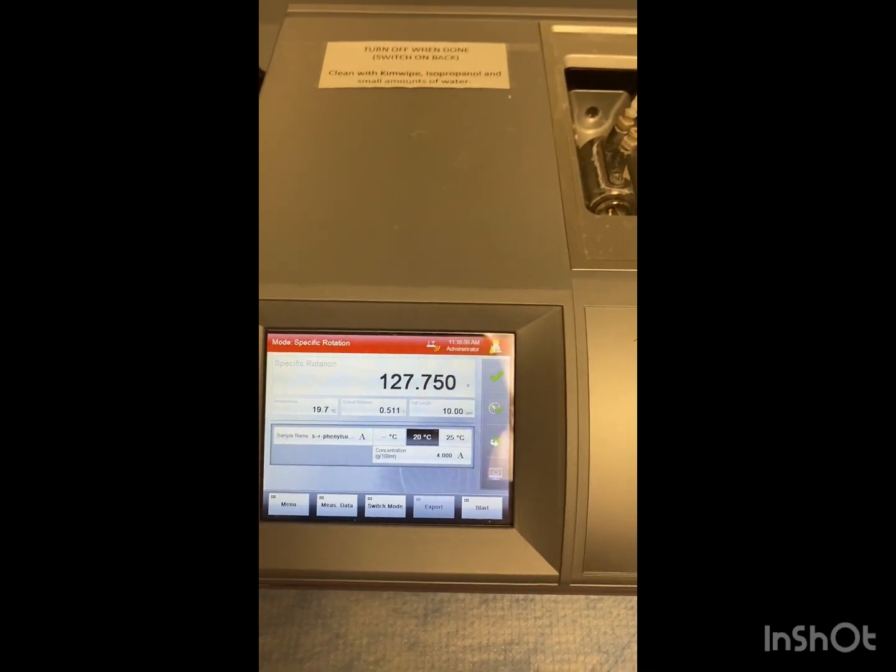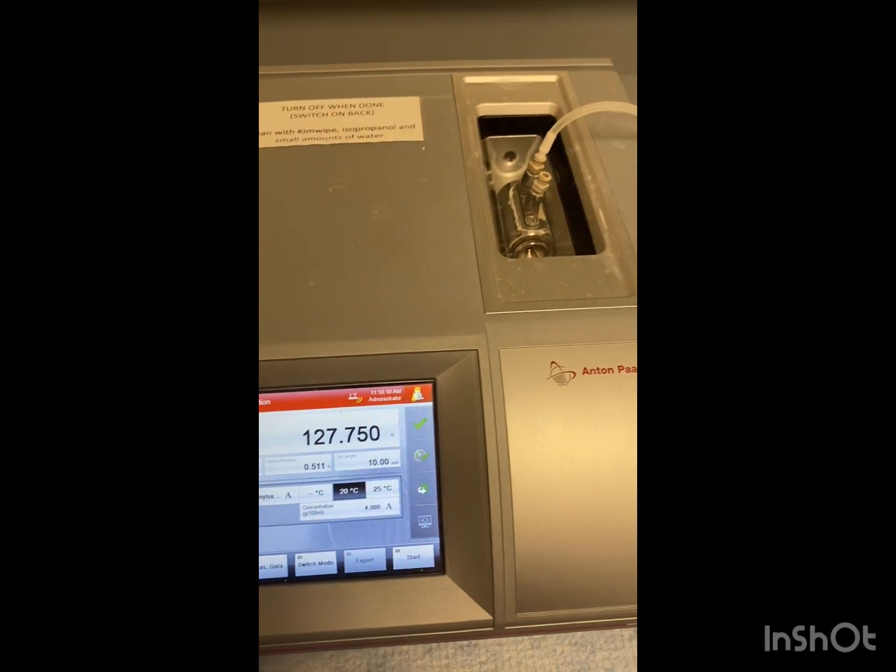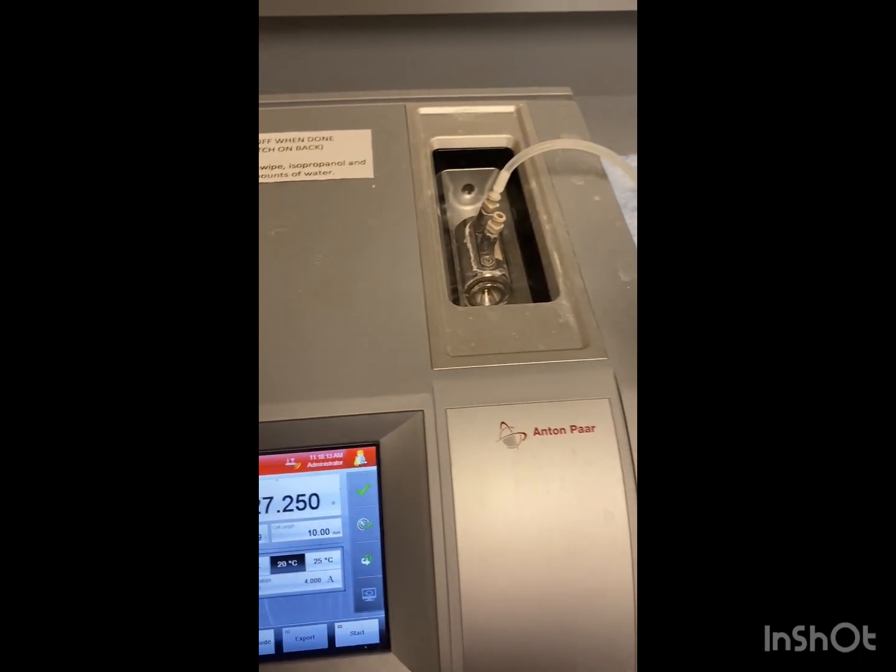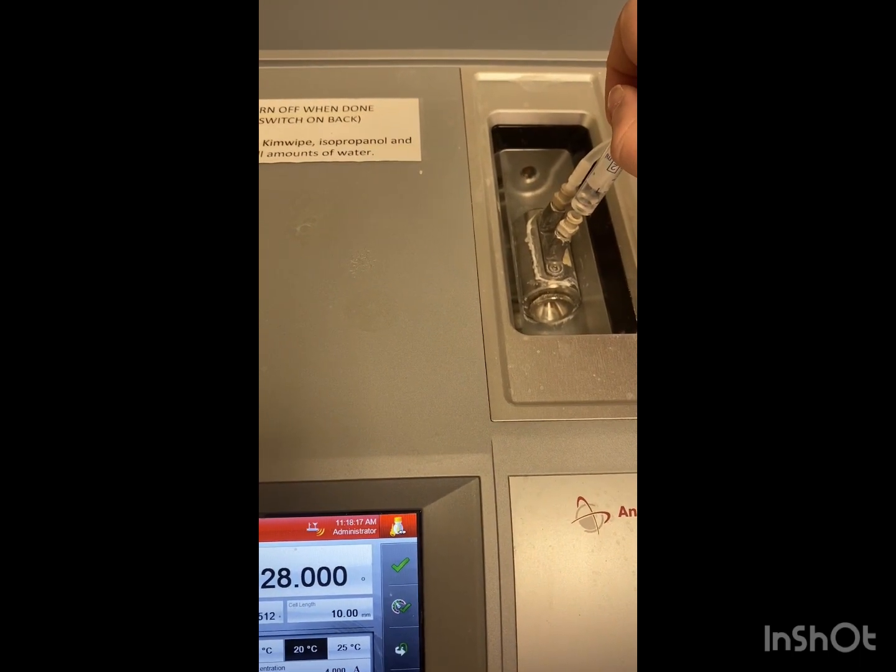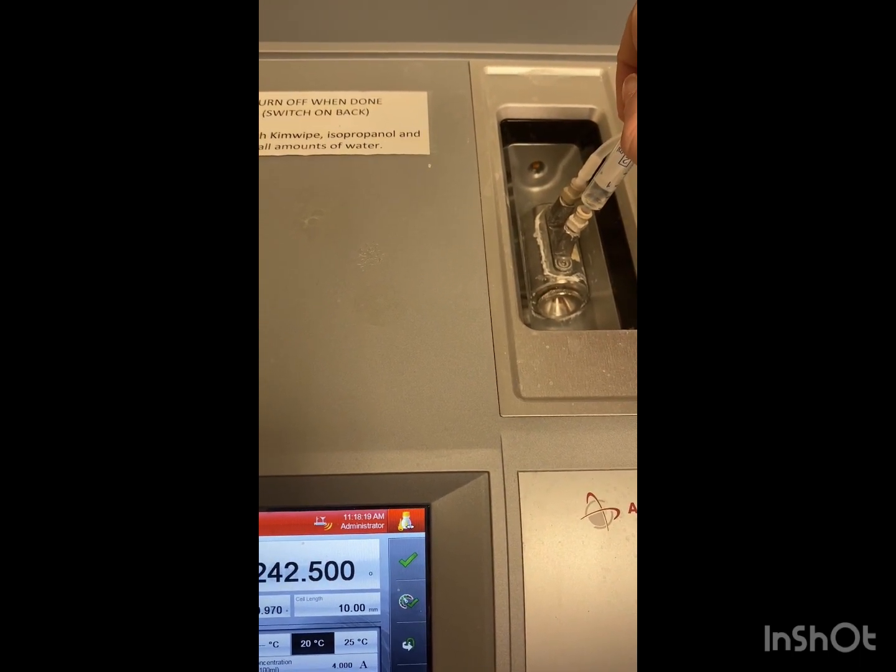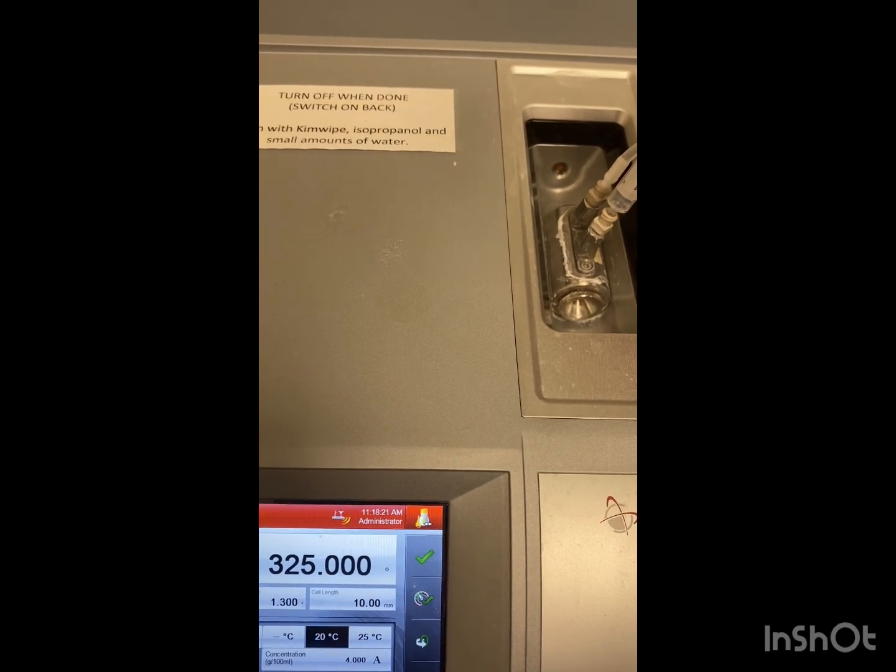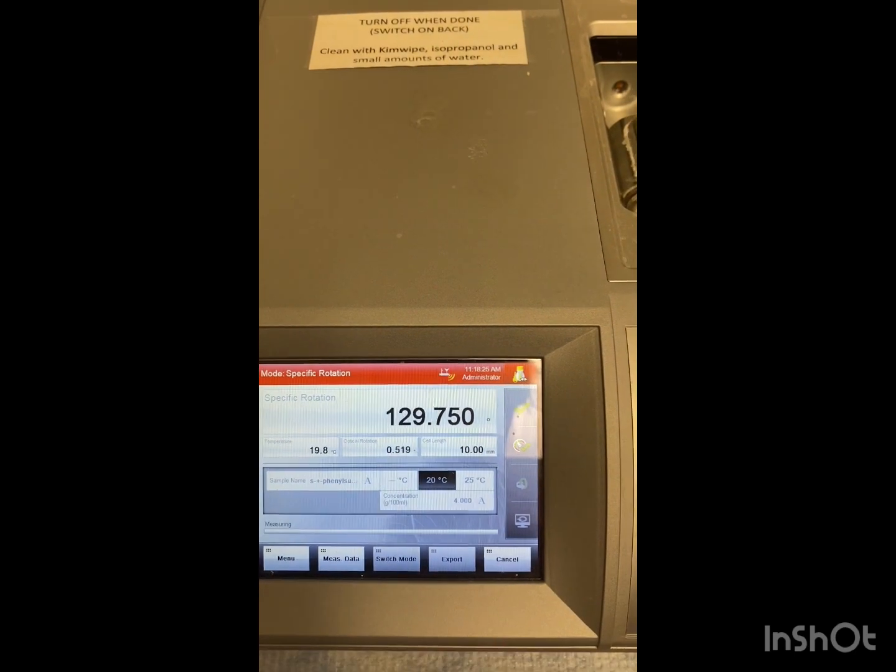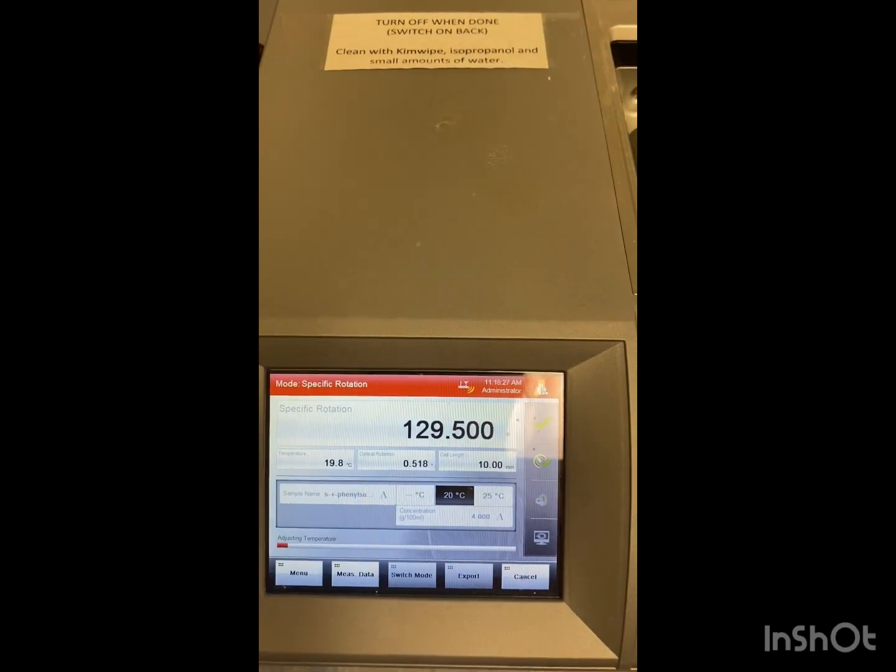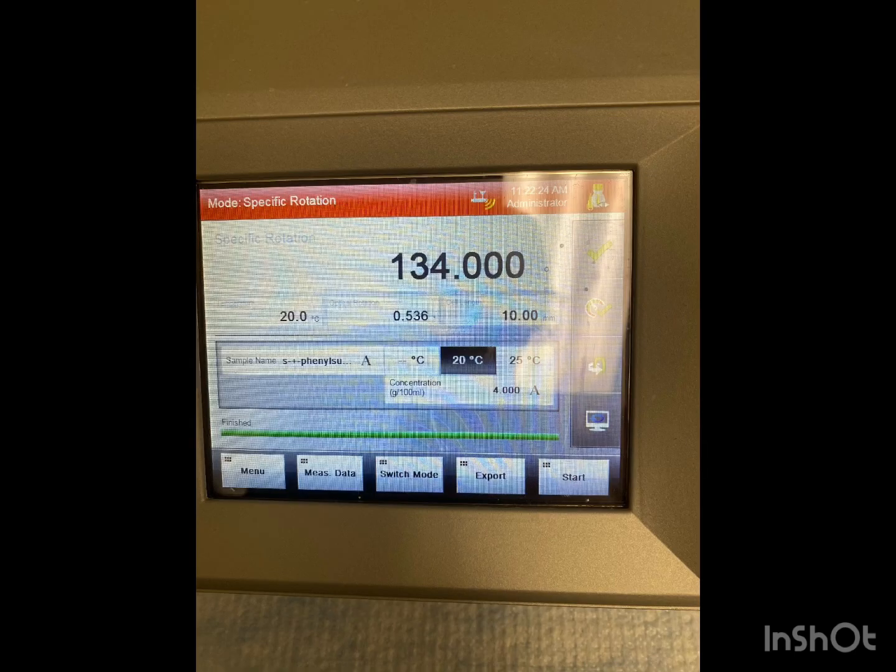Alright, so we've turned the polarimeter on, we've got our cuvette with our solution in it. We're going to put it in the polarimeter. Alright, and then we're going to hit start. So our product had a specific rotation of 134. Whee!